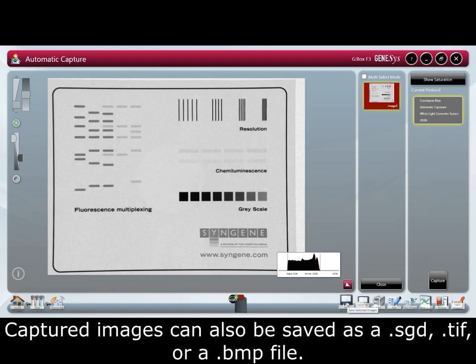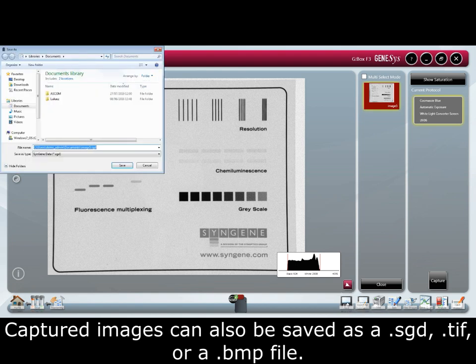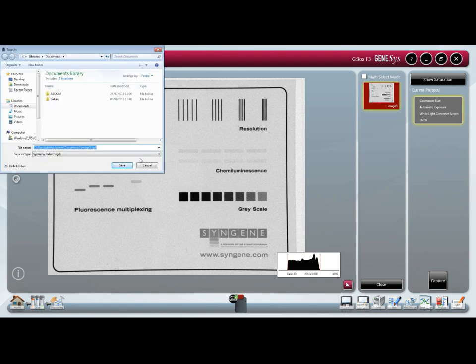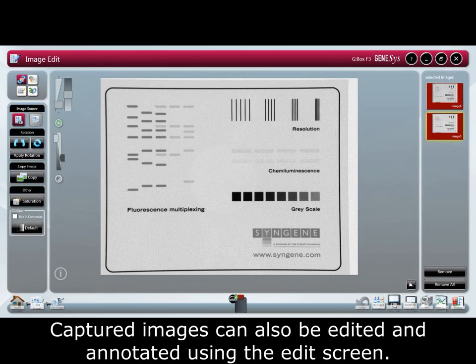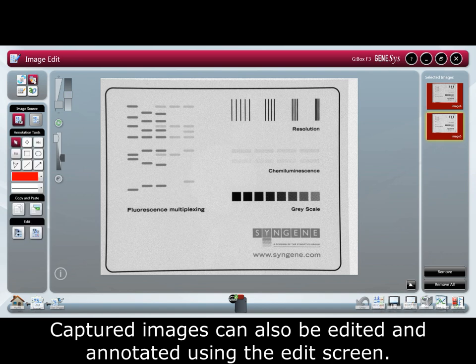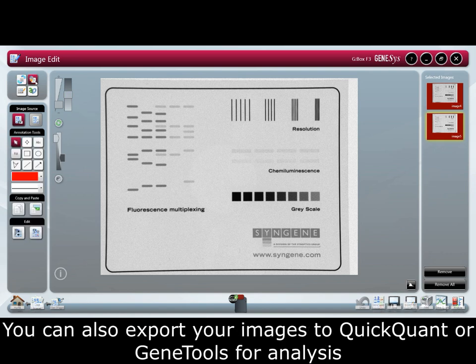Captured images can also be saved as an SGD, a TIFF, or a BMP file. Captured images can also be edited and annotated using the edit screen. You can also export your images to QuickQuant or Gene Tools for analysis.